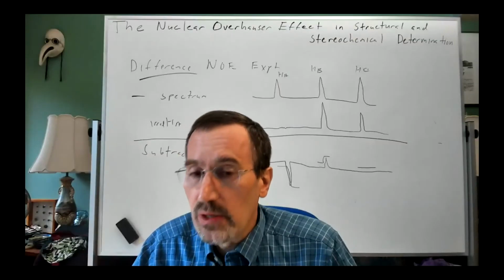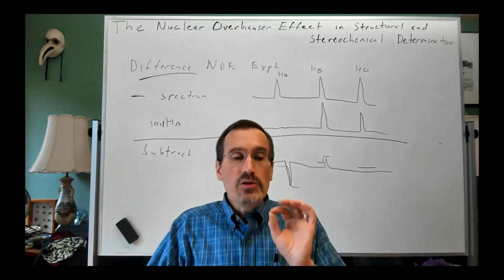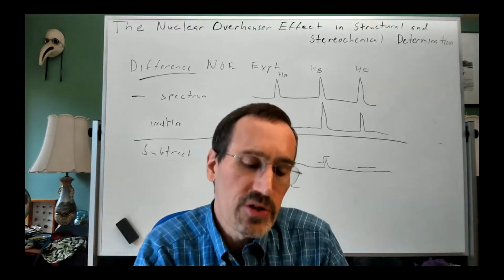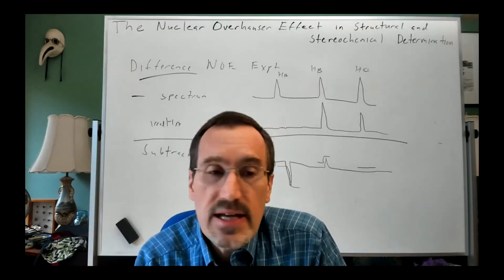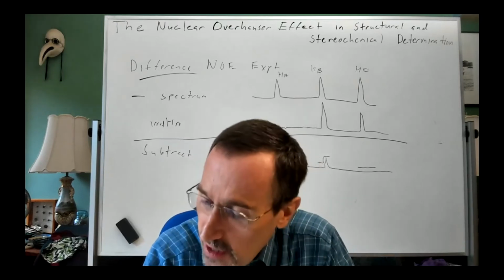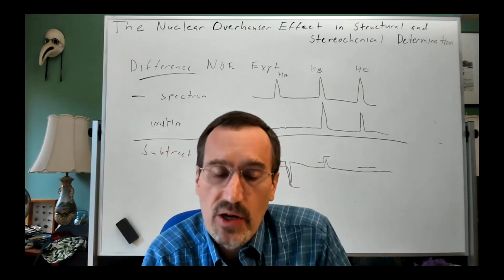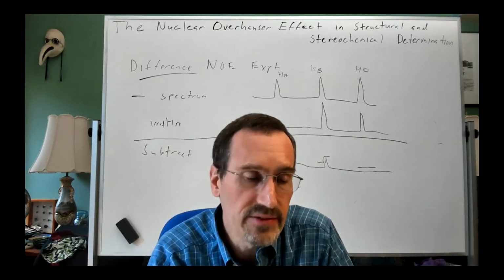If possible. Basically you want as much corroboratory data as possible. And honestly, if I had done this experiment, I might have just done the reverse experiment and said, the heck with it, I'm not going to even be able to hit that doublet of doublets selectively.